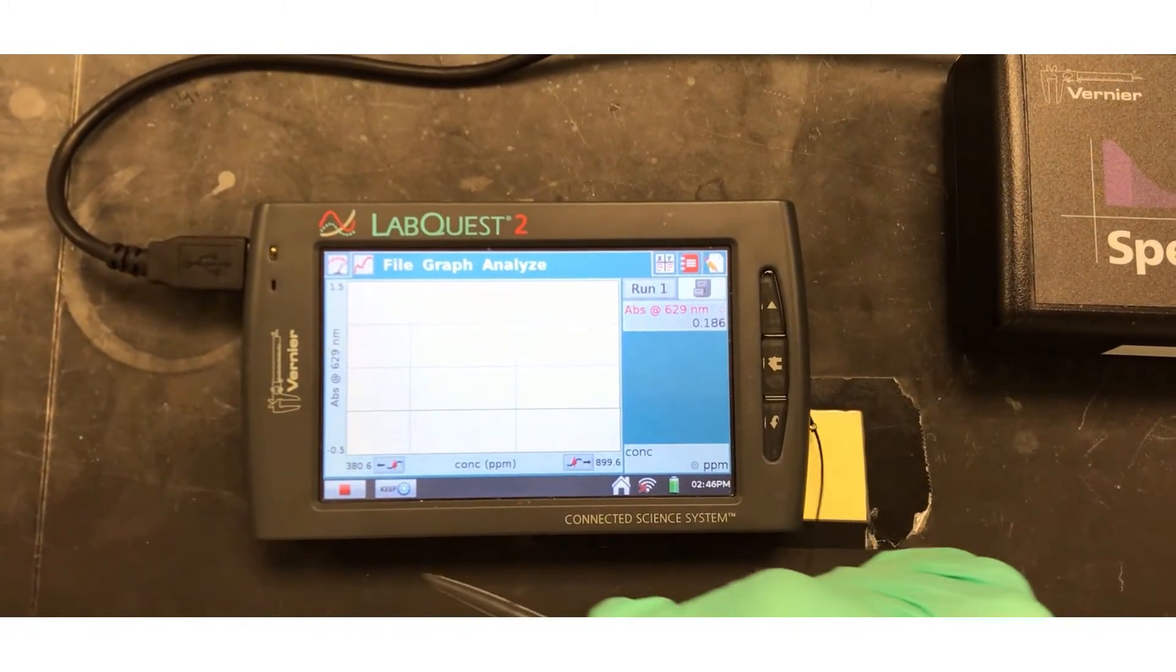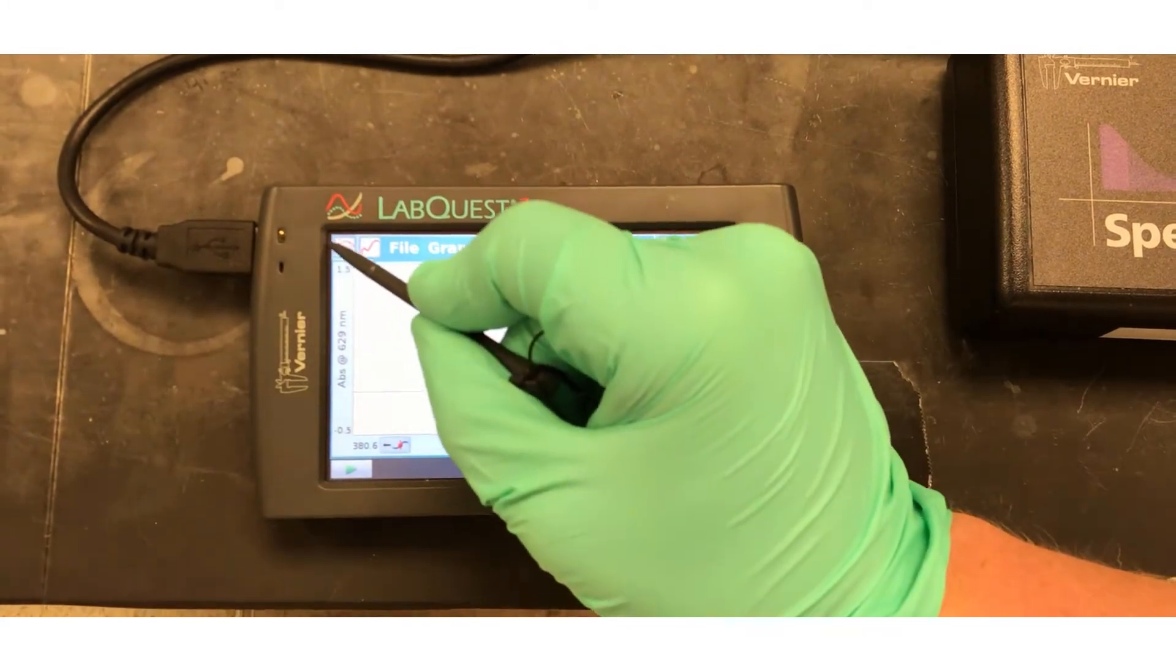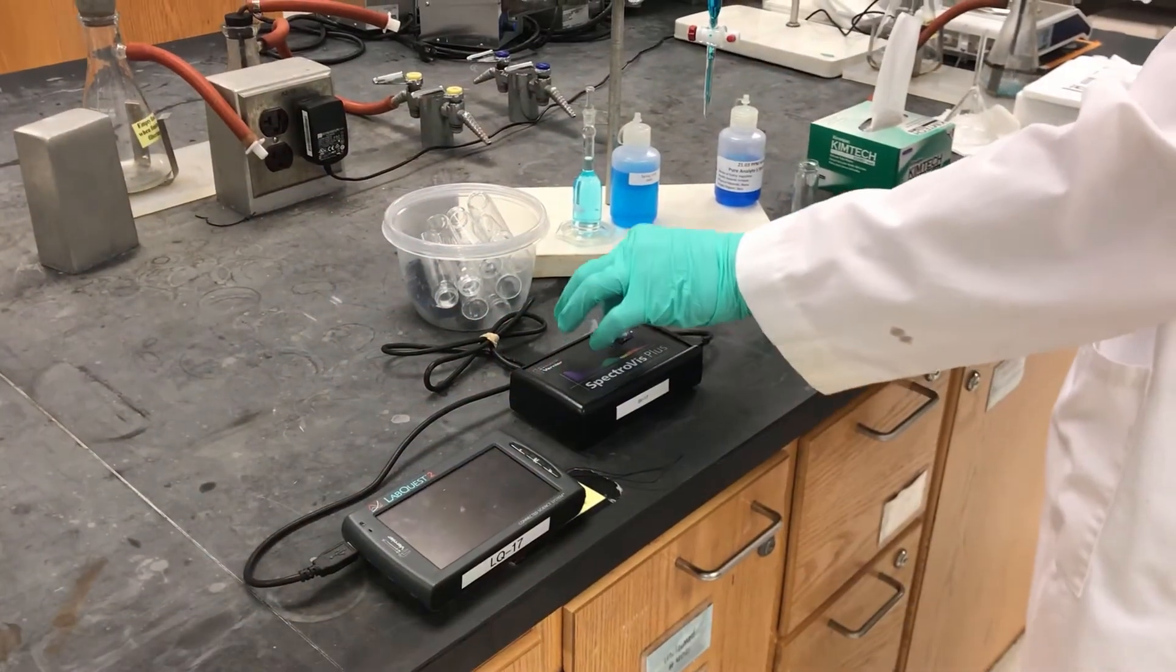The meter in the top left-hand corner displays the absorbance. An absorbance of 0.185 is below ideal for this experiment. Let's try one more sample.